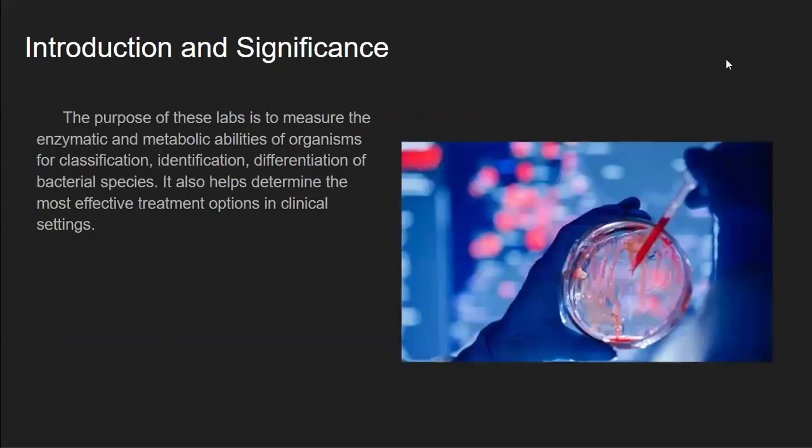Introduction and significance. The purpose of these labs is to measure the enzymatic and metabolic abilities of organisms for classification, identification, and differentiation of bacterial species. It also helps determine the most effective treatment options in clinical settings.